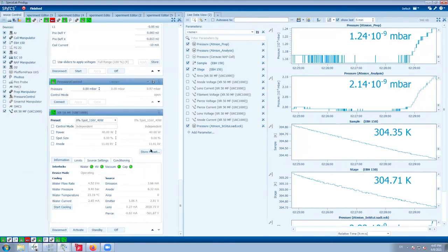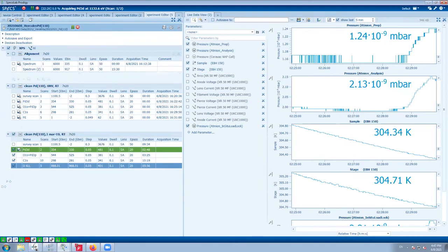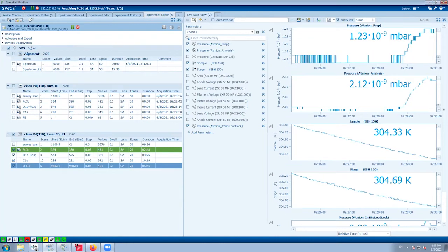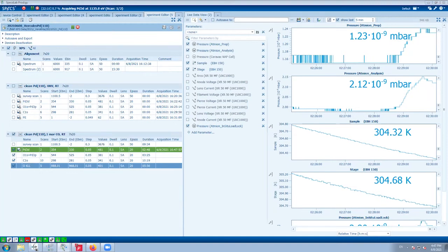And as I told you, it's quite an advertising trick how the manufacturers advertise their machines. I remember when we were buying this, we were not very experienced, and they told us, okay, it's possible up to 20, up to 30 millibars, something like this. But then later you realize that things are different.